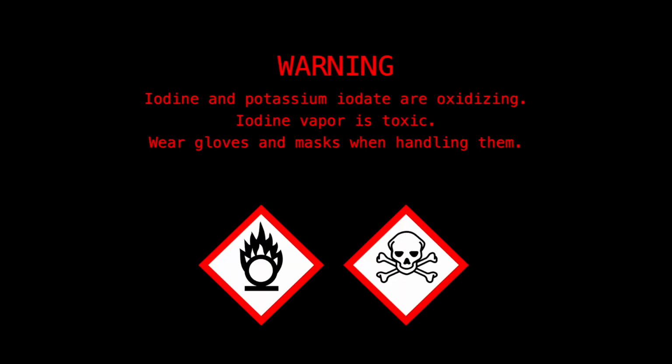Warning: iodine and potassium iodate are oxidizing. Iodine vapor is toxic. Wear gloves and masks when handling them.